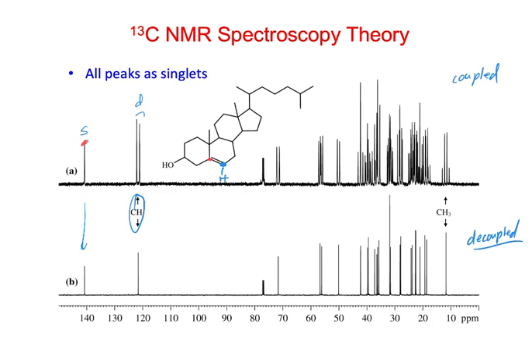Okay? If we look down through here, we could just pick out some of these other ones. We talked about already that this carbon here is the one where the alcohol is attached. Notice if we look up here, this one's a doublet because this carbon has one proton attached. Okay? The other one that's easy to pick out, like this one down here, it's a quartet, right?